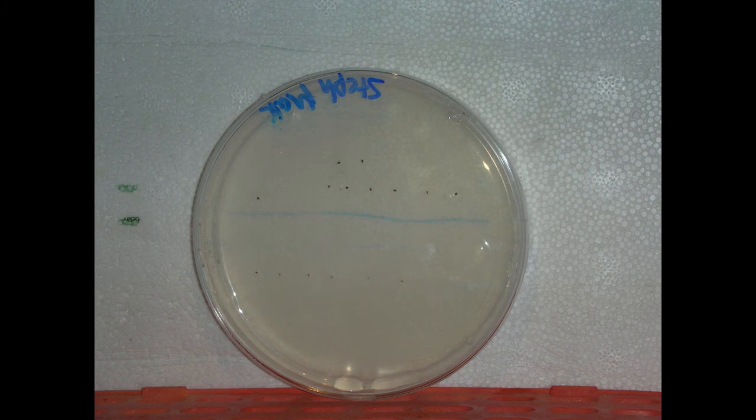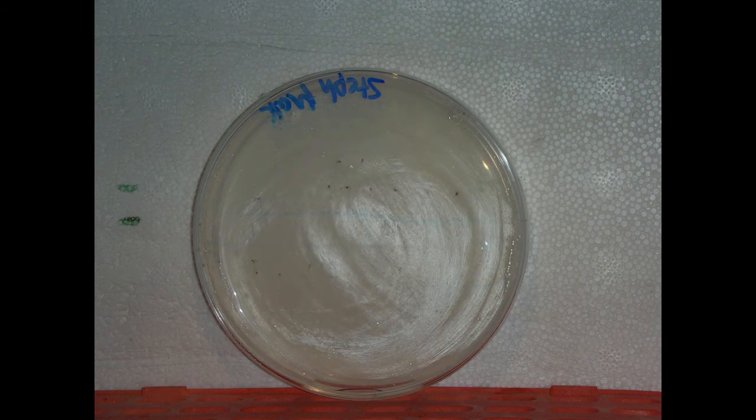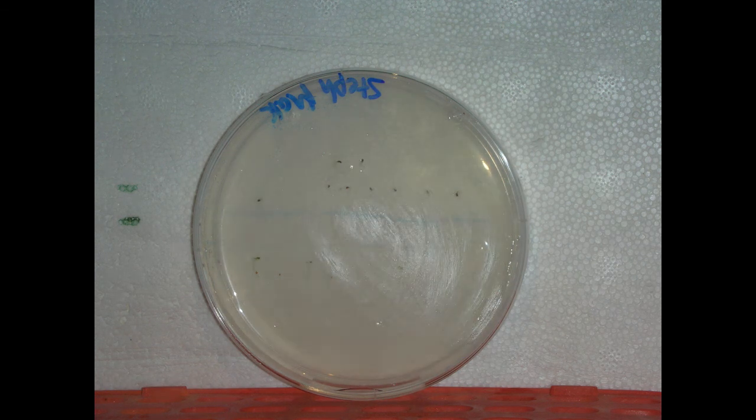This project is based mainly on scientific observation rather than traditional experimental procedures. The only methods that were used for this study were: 1. Sterilizing tobacco and arabidopsis seeds and planting them in an agar medium. They were then allowed to grow over a period of 5 days while a time-lapse video was taken. After 5 days, the plants were placed on a slide and viewed under several different microscopies as shown shortly.